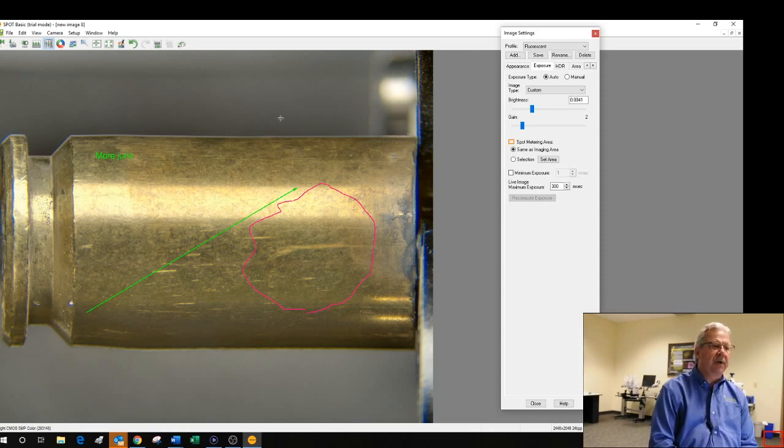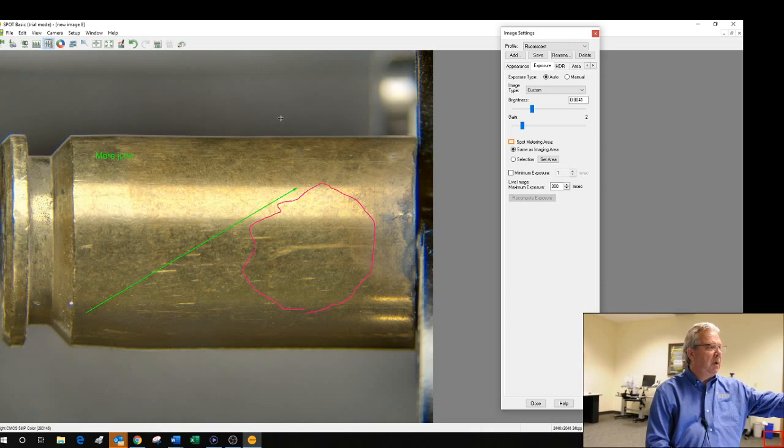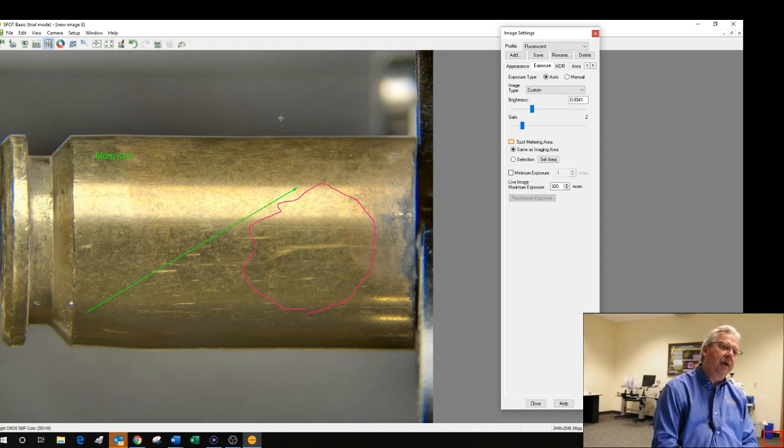First and foremost, the most common thing that we see is that we're not sending light to the camera. So we want to take a look at the photo tube or Trinoc we have. I think almost all of you have a photo tube, and there's a push-pull rod on that, whereby you can choose either all the light going to your eye, or all the light going to your eye and your camera, split between the two, if you will, which is the position we want. I suspect you've been using it long enough that you've got something other going on than that.